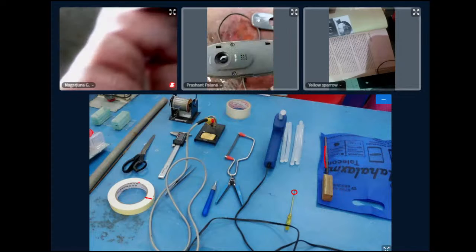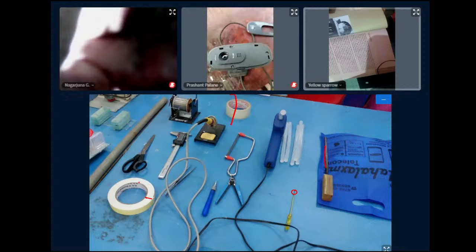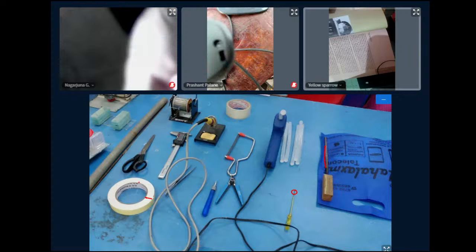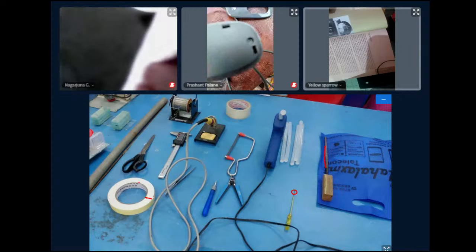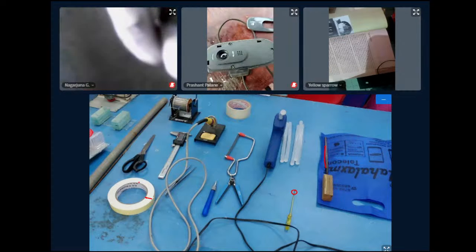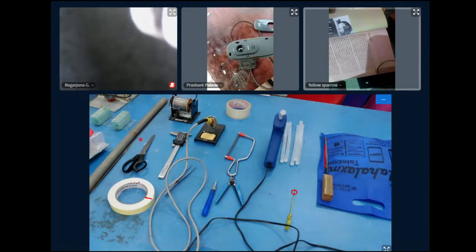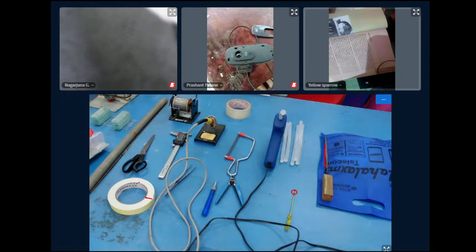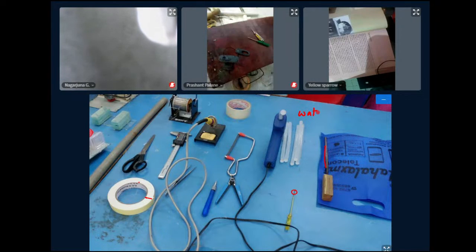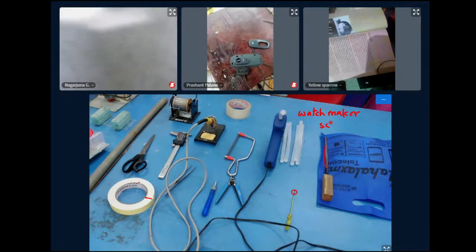Technically, if you want to procure the right screwdriver, you can buy a low cost set of laptop screwdrivers, or a watchmaker screwdriver for around 200 rupees. The watchmaker screwdrivers are much smaller. You require an M2 screwdriver. Generally, what is available is M3 and M4 screwdrivers, and they won't fit inside that hole.